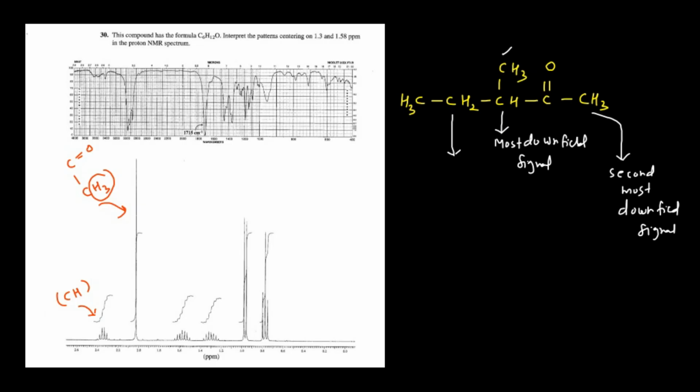So both these are beta, but you can see this beta carbon is having only 2 hydrogens, so the deshielding effect will be higher on these 2 hydrogens when compared to these 3 hydrogens. So this would be your third most downfield signal. It clearly indicates that this particular signal is due to the CH2 group. This typical pattern is due to this CH2 group, right?